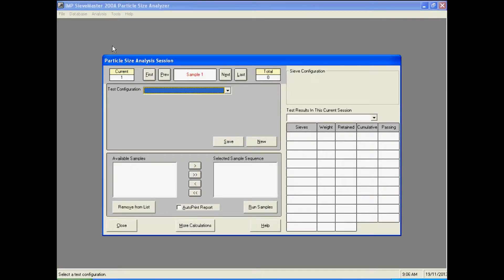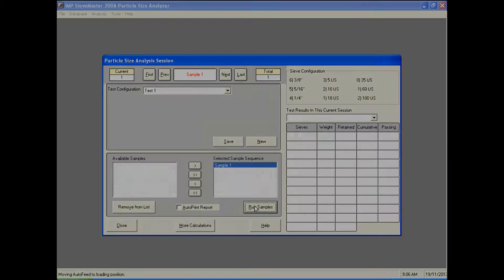Its highly automated operation substantially reduces the resources required for manual particle grading and frees up valuable time that the operator can use to perform other tasks.